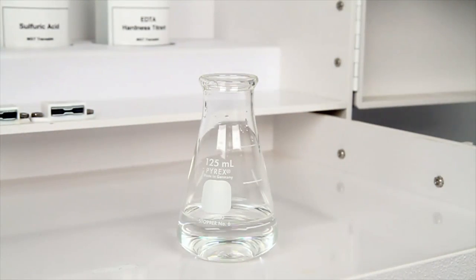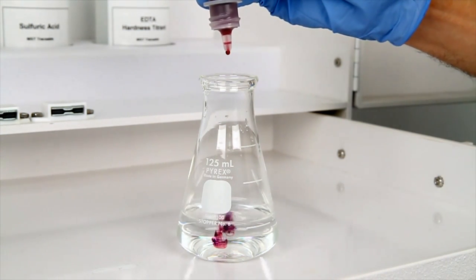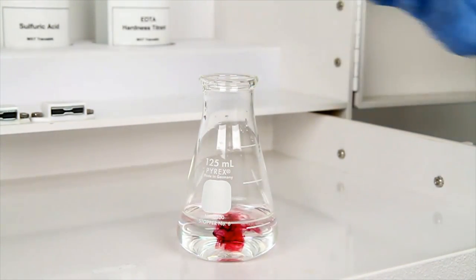Next, add 7 drops of hardness indicator solution. Remember to hold the bottle vertically and swirl after the addition of each reagent.